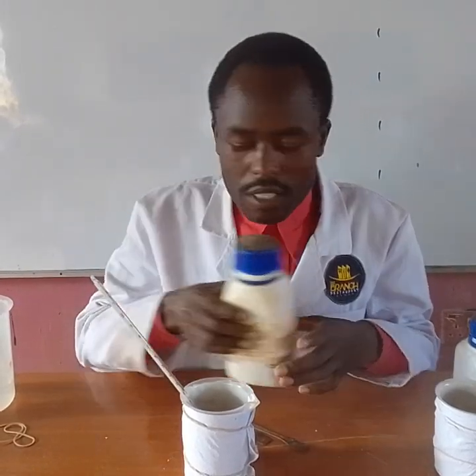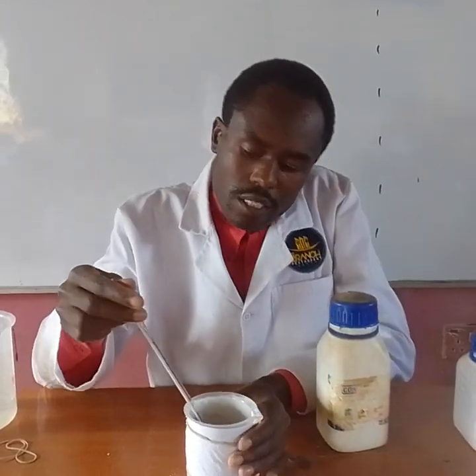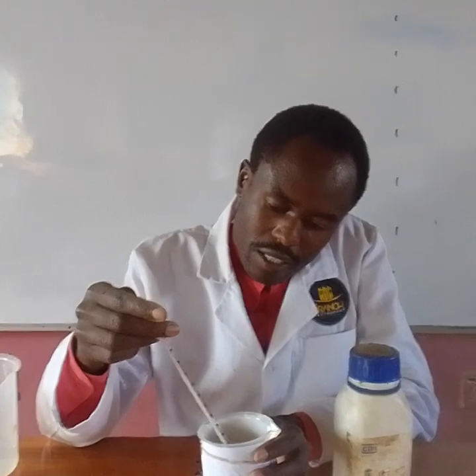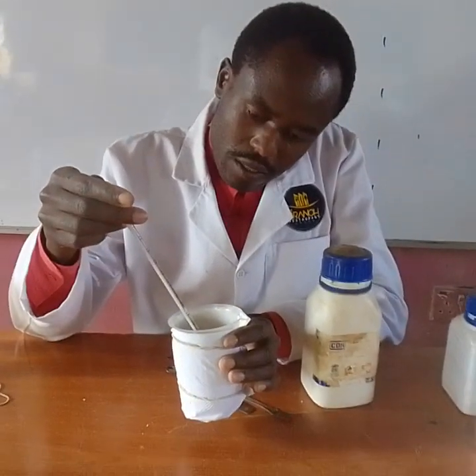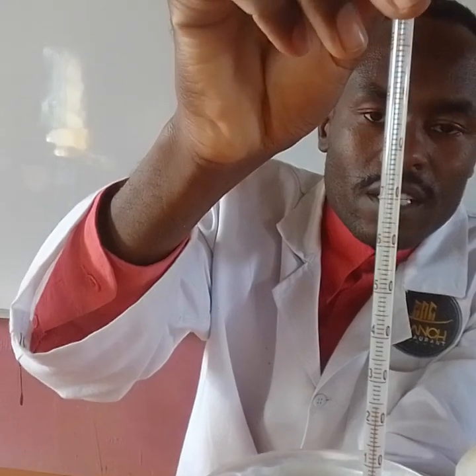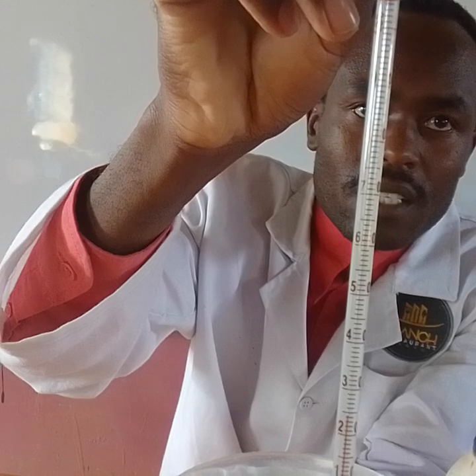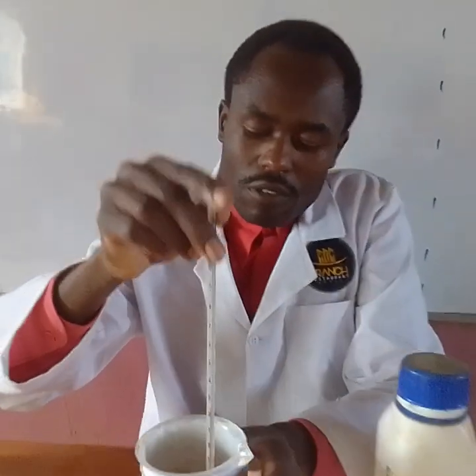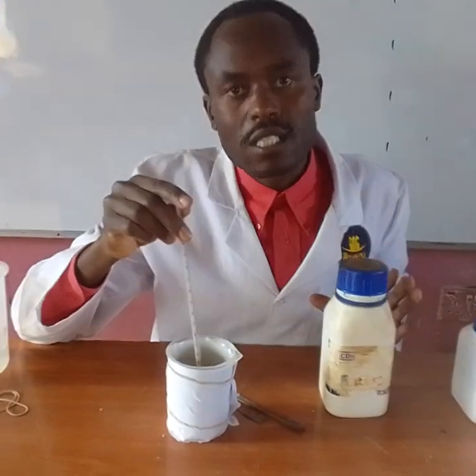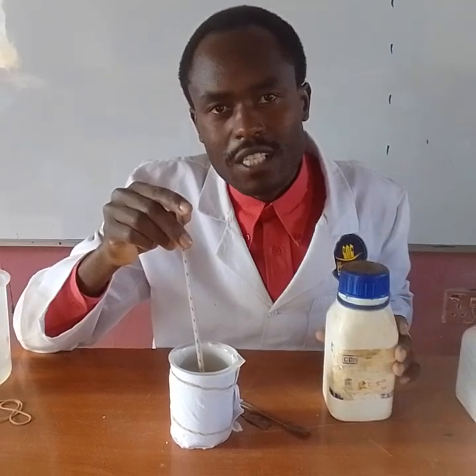Before I add the salt, let me first read the steady temperature of this water. It is 24 degrees Celsius.